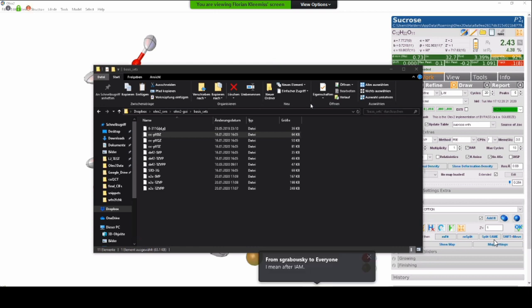Is multiplicity for more than one metal? The formula should be 2S plus 1. With multiple metal centers, you have to play around a bit, because the situation might be so complex that you cannot just draw the MO diagram on paper and guess the multiplicity correctly. So you can run various models and see whether the wave function converges and whether the results get better.